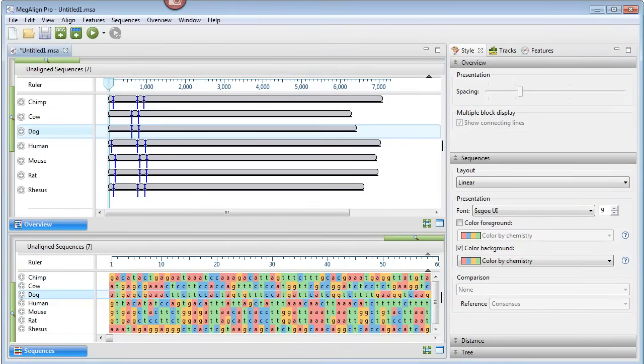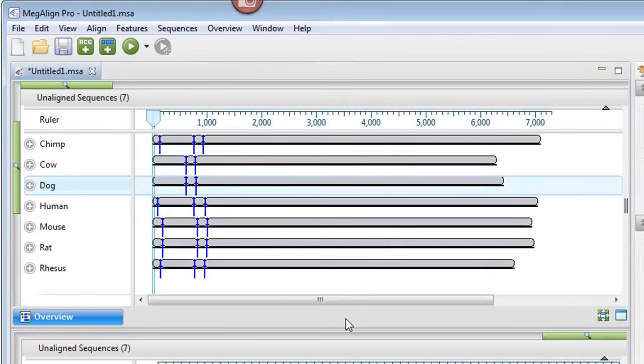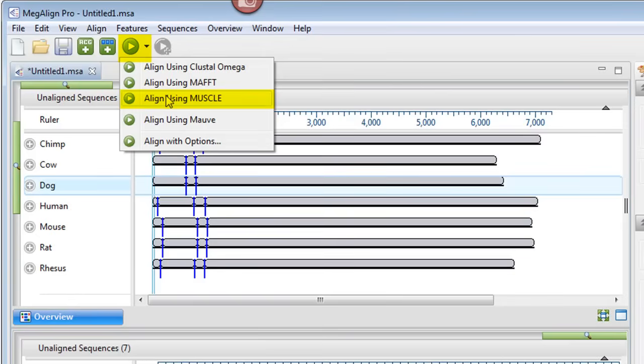Now we can align the multi-segment sequences. For this example, I'll use the Muscle algorithm. To do this, we just click on the Align button and choose Align using Muscle.